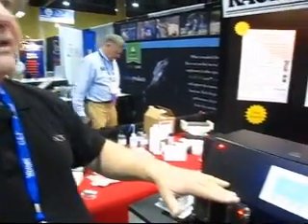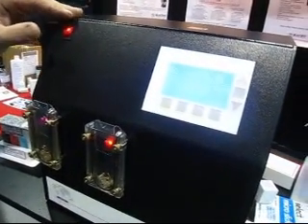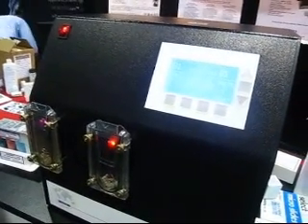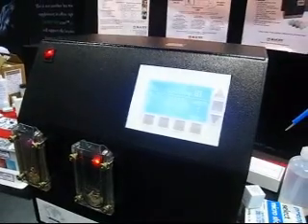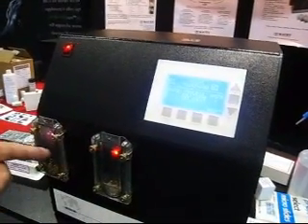When the time has been completed, it will automatically alert you with an audible signal. You'll remove the slides, and the unit will automatically clean itself. There is no transfer or carryover of sample to sample because each chamber is completely clean between samples.